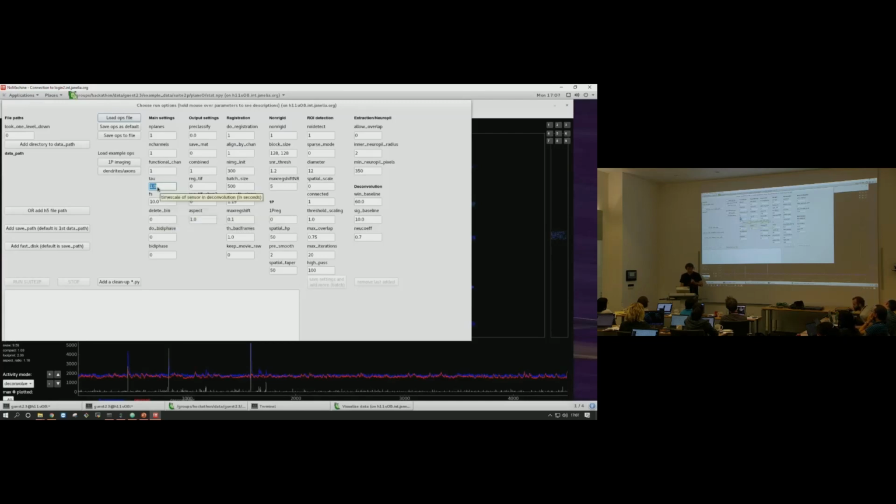Roughly, for GCaMP6 slow, 1, 1.5, 2, they're probably all pretty similar. If I had to give an average, GCaMP6 slow, maybe 1.3 seconds, and the corresponding 7 ones too. The medium would be like 1 second.